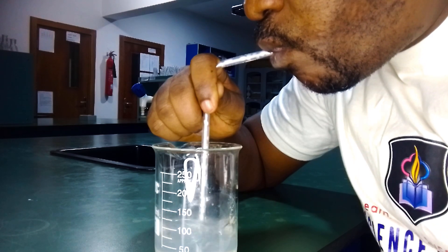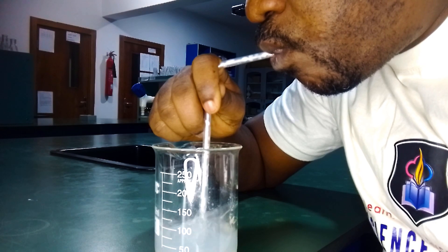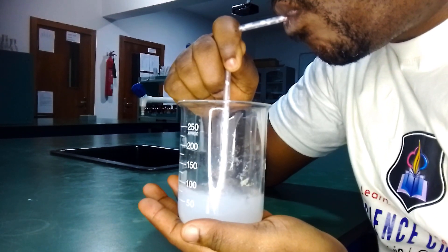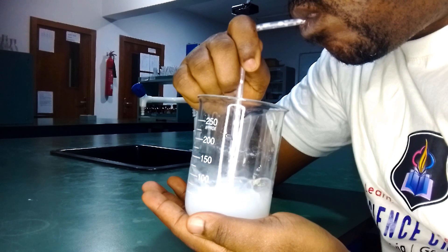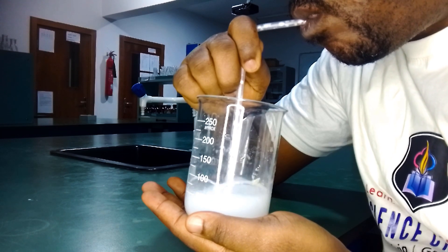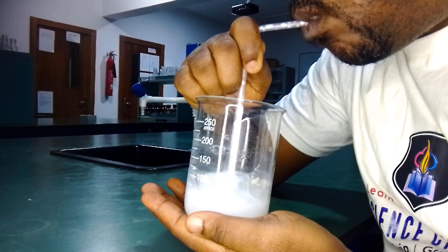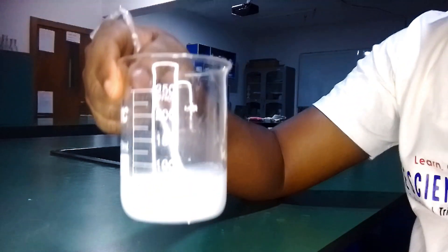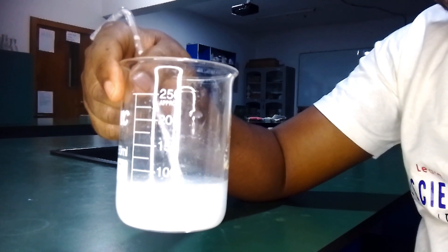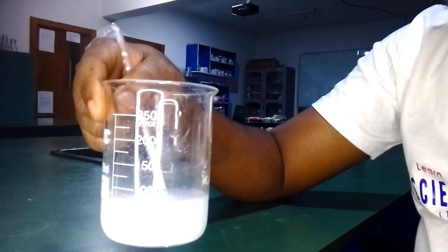Let's go. What do you see here? Can you see that the lime water has turned milky? Now, what does this prove? That the air we breathe out contains carbon dioxide, and also that carbon dioxide turns lime water milky.